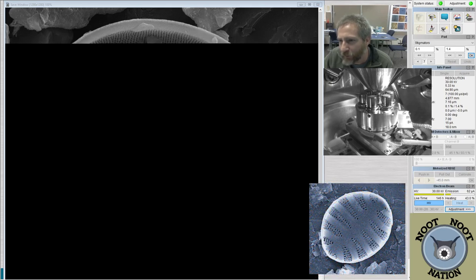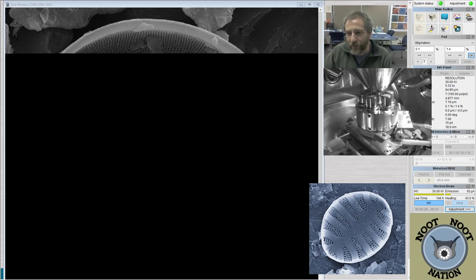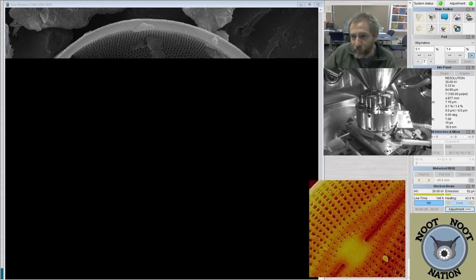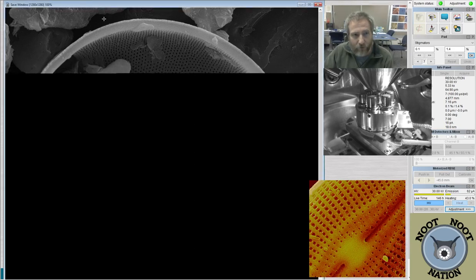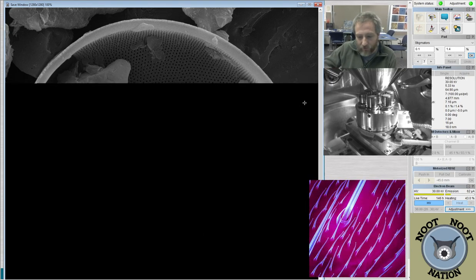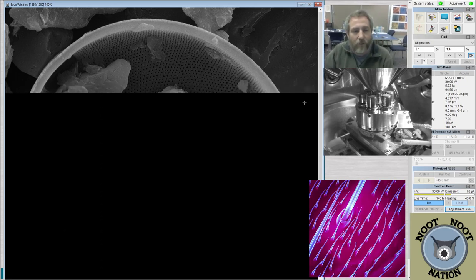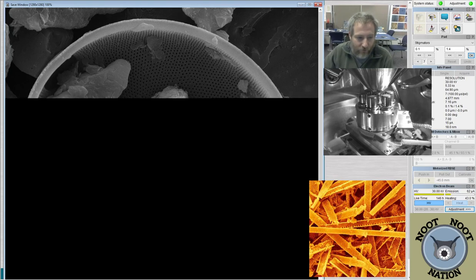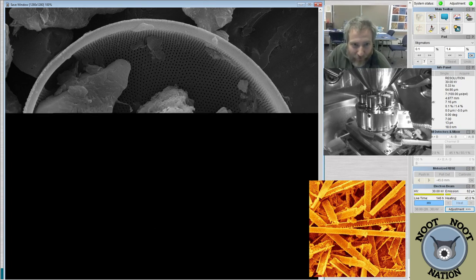Can these things travel upstream? No, they travel downstream. They are being carried downstream as the current flows. And probably something like this is normally attached to the bottom. So probably this diatom, which is Pleurosira, would normally be living attached. And the reason that we're seeing it in the water is the flow of the water causes it to get detached and then carries it downstream. And then it ends up being deposited, in this case, behind a train car that had fallen in the river and created a bit of a baffle for the current.